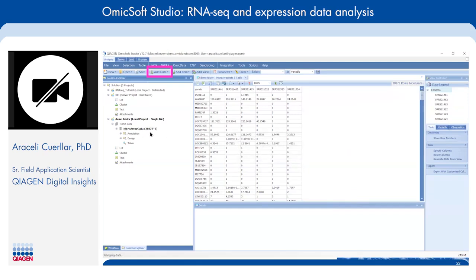So once you do this, the first thing that you will notice is that you now have some new items to look at. So here, when we take a look at our folder, we now have an omics data object where we have our object that we just added, right? And so if we take a look at this omic data object, this represents our raw counts coming from our matrix.